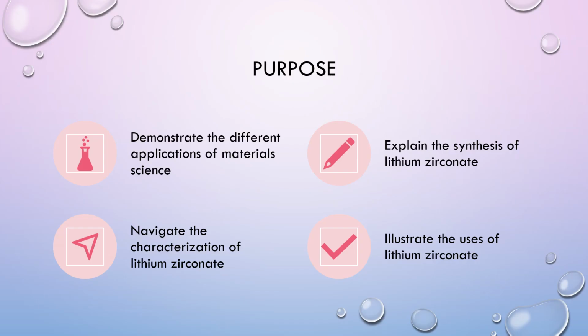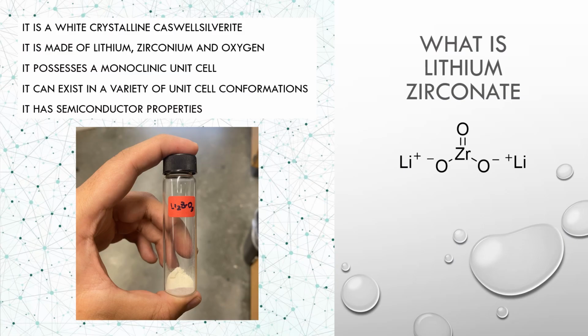The purpose of this presentation is to demonstrate the different applications of material science throughout this research project, explain the steps to synthesize lithium zirconate, navigate how to characterize the synthesized zirconate, and illustrate why this project can be useful. So what is lithium zirconate?